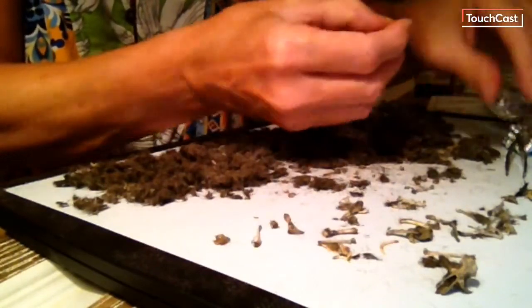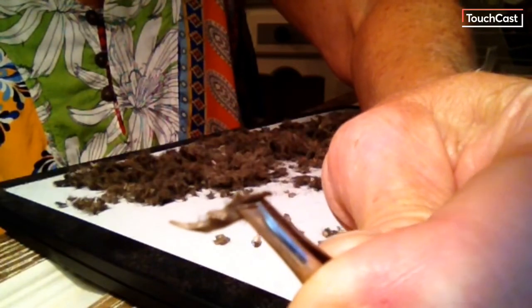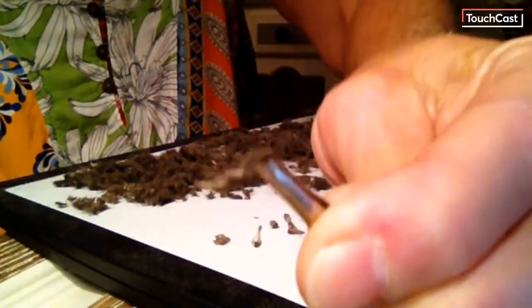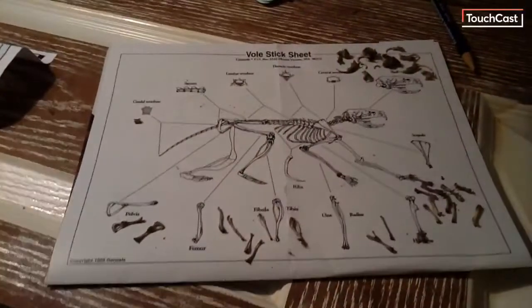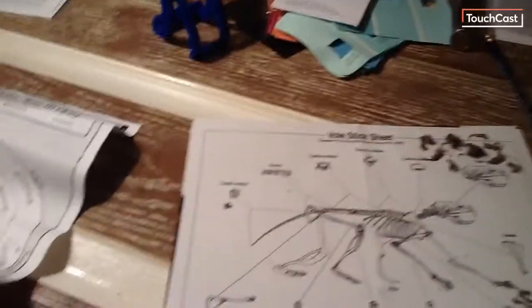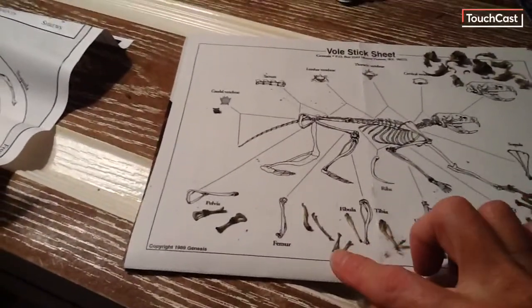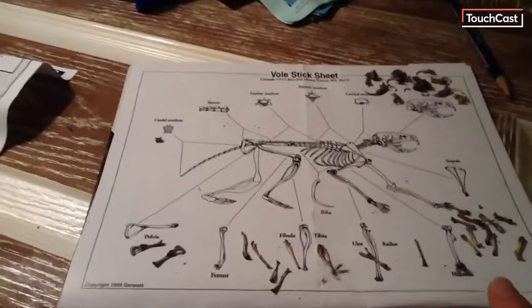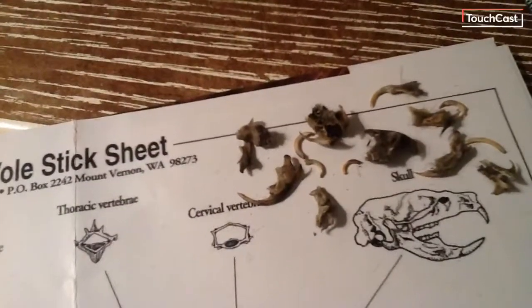Here is a terrific little jawbone. You might be able to see the little teeth. Here's a pile of fur. And on this chart we have some of the bones — you can see the difference between the drawing and the actual bones that I was able to tease out of the fur. You can see some leg bones, some arm bones, some teeth, and different parts of the skull.